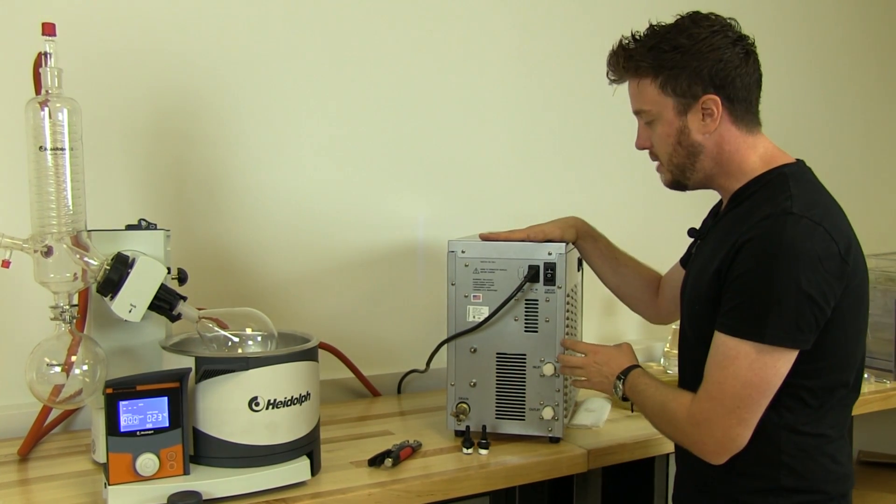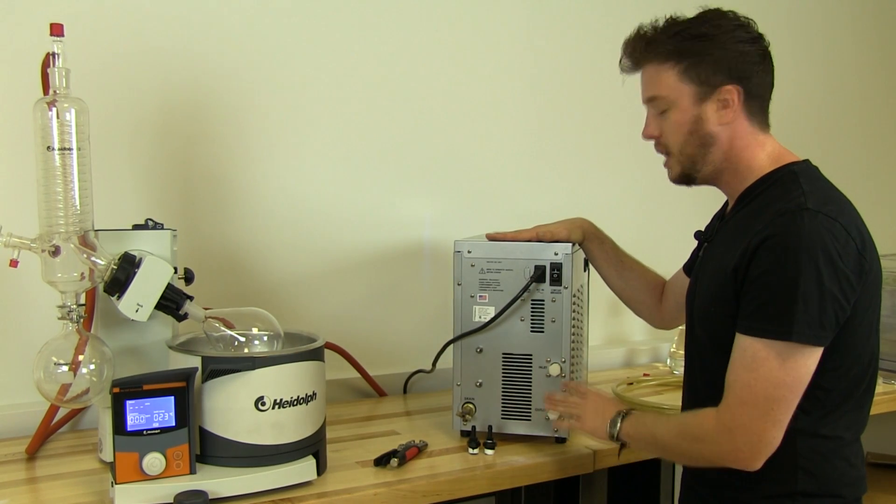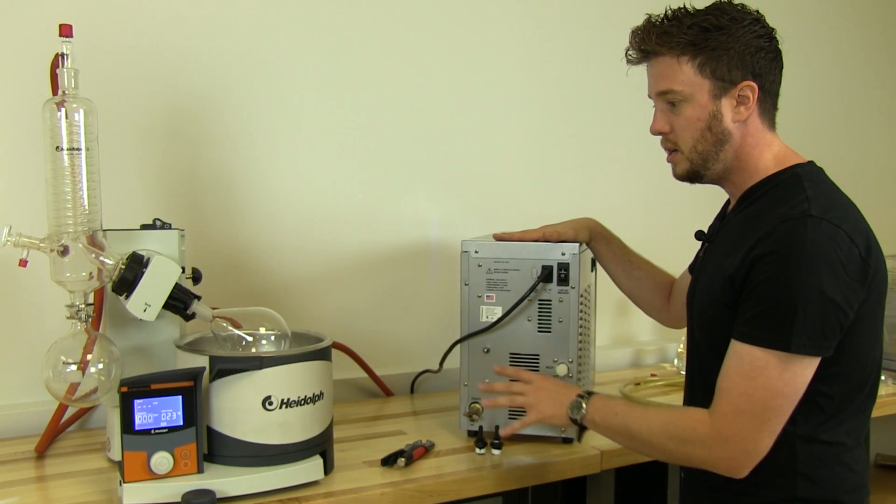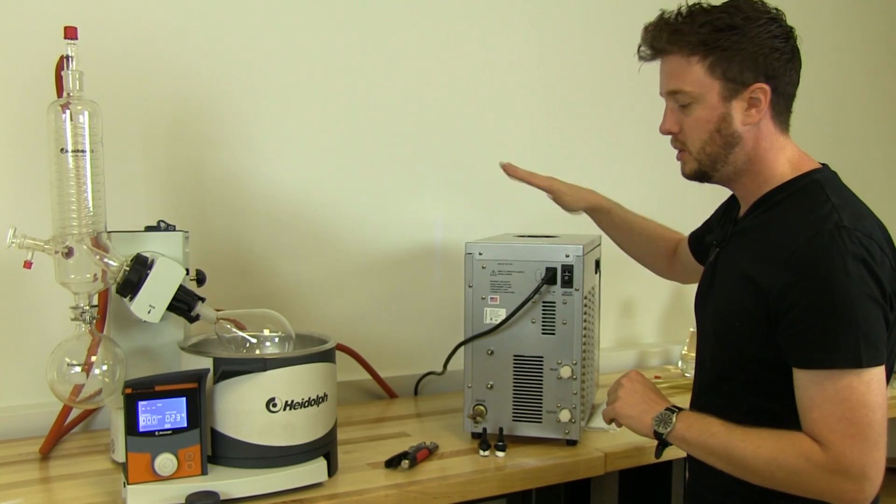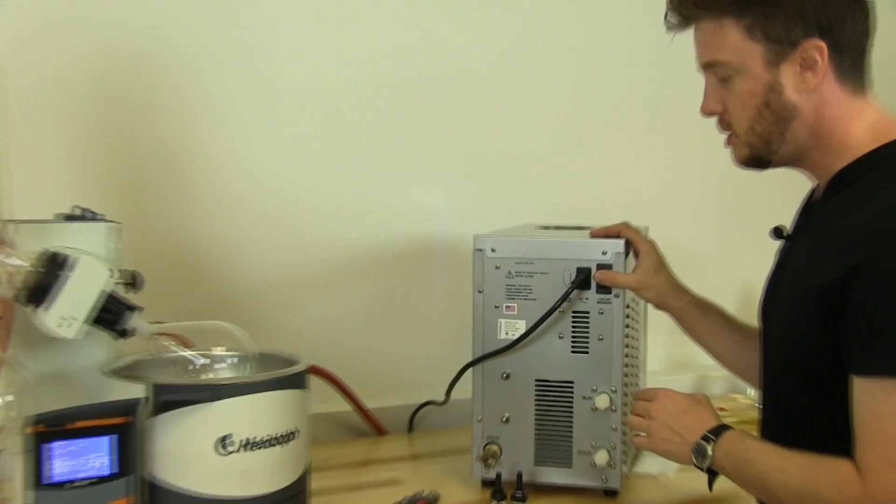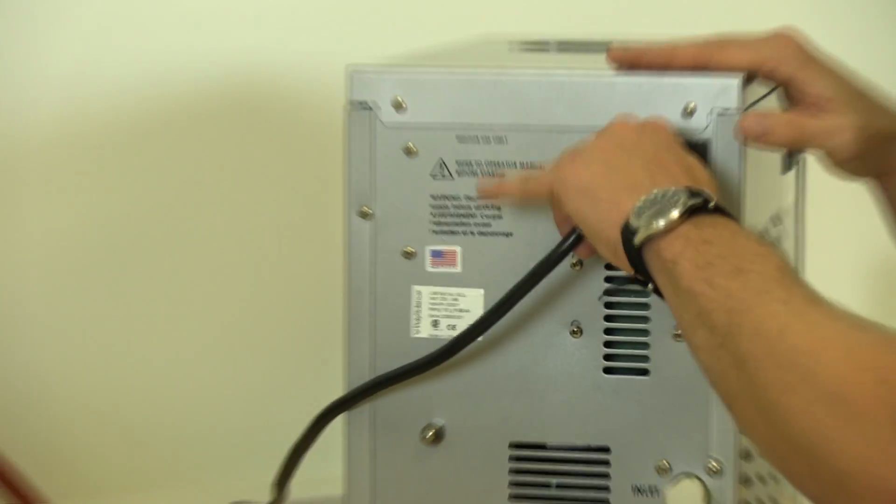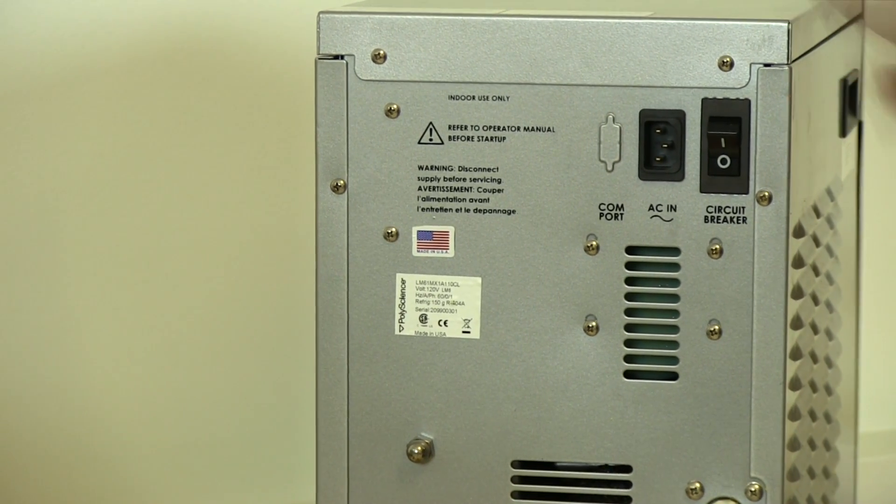Now we are at the rear of the LM6 mini chiller, and we're going to show you how to attach the fittings and connect it to the rotary evaporator, filling with glycol mix and getting this all rolling. First thing you want to do is make sure the machine is off. This chiller should not be connected to power during any of these processes.